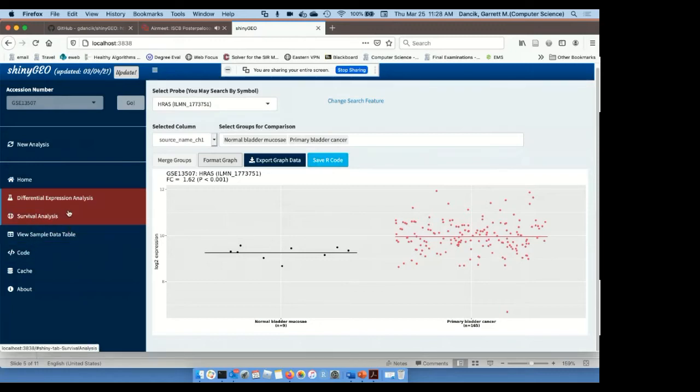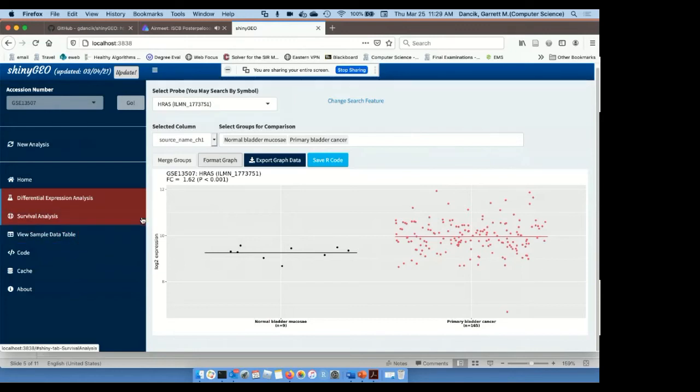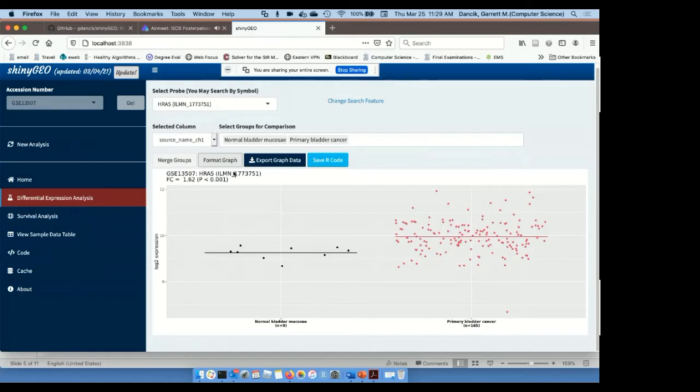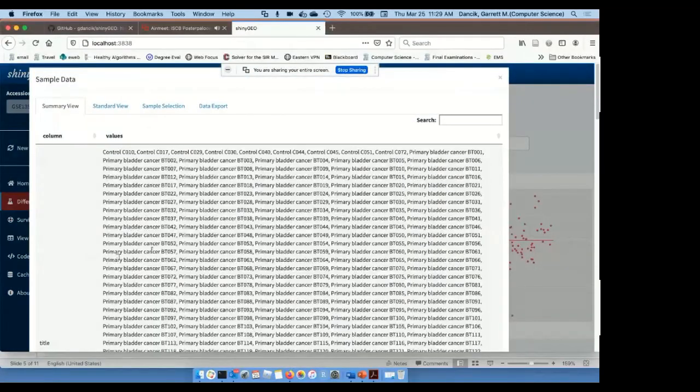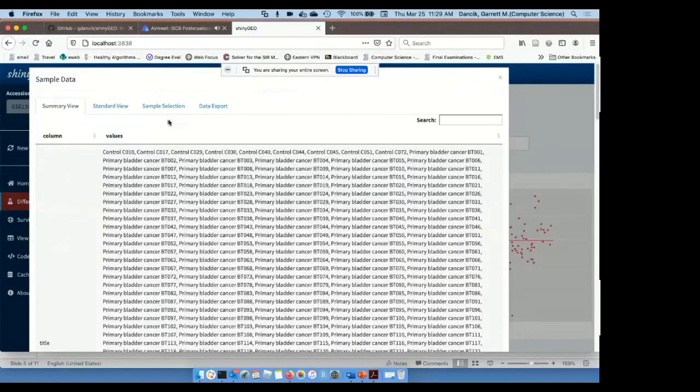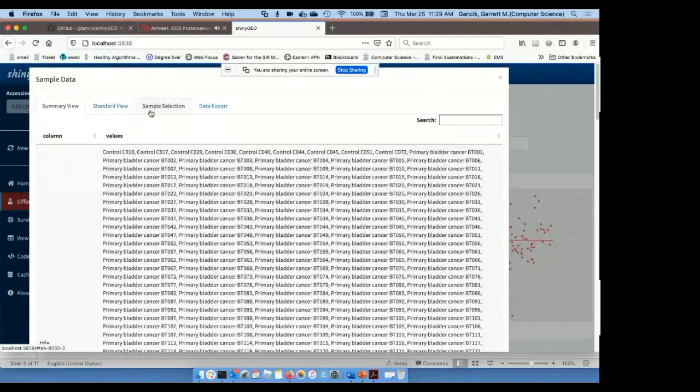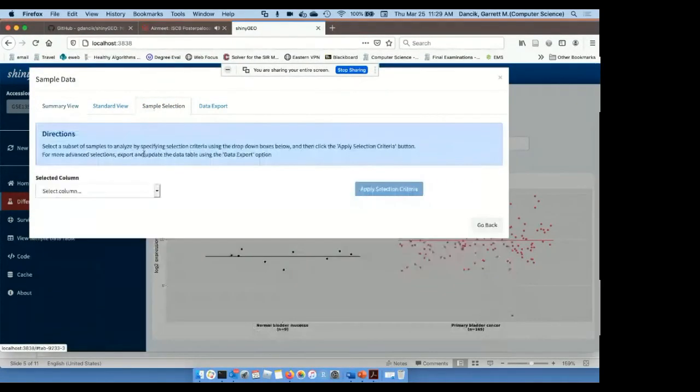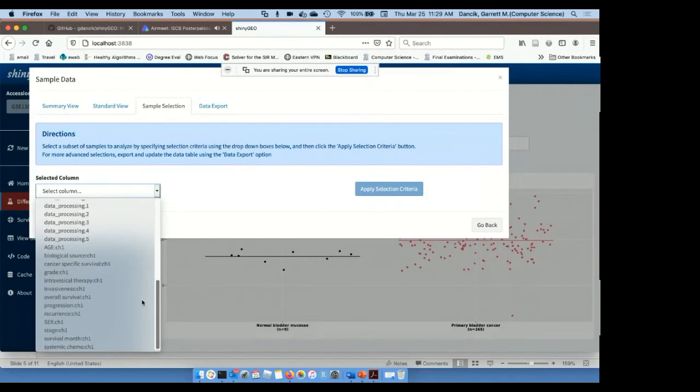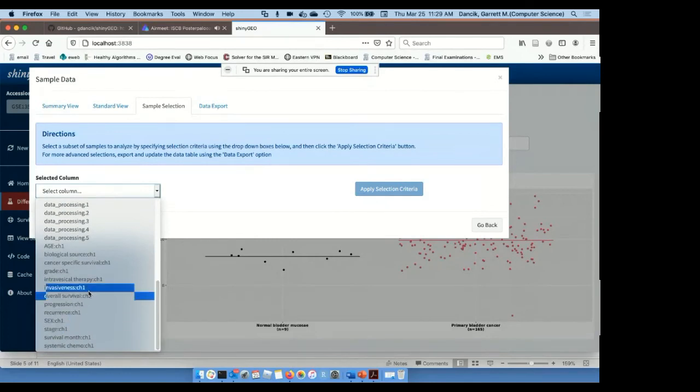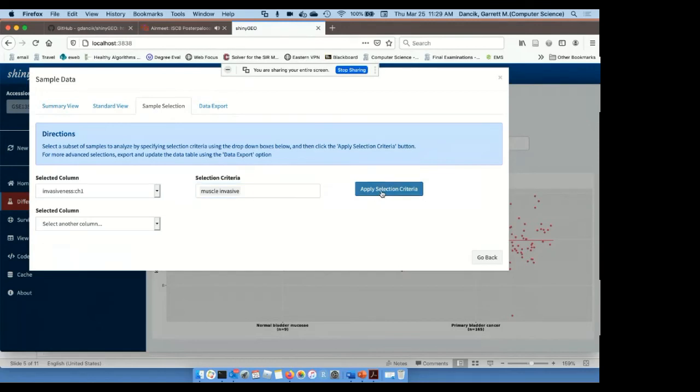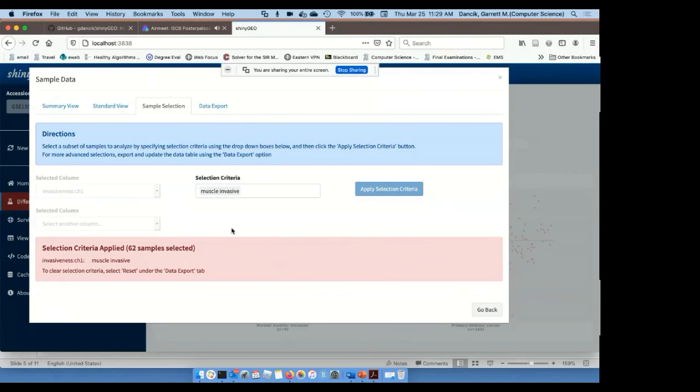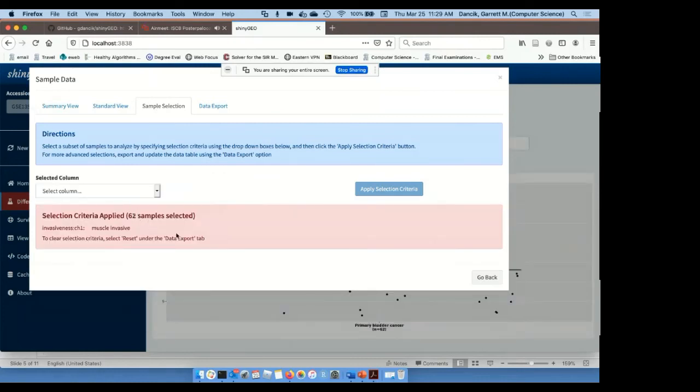I'm next going to do a survival analysis. But before I do that, what I'm going to want to do is look at just the patients with muscle invasive tumors. So my research question is whether HRAS is predictive of survival in bladder cancer patients with muscle invasive tumors. And so I want to do a patient selection or sample selection, which is straightforward to do. So I click sample selection, I select the column containing the information that I want to select on, and that's this invasiveness column. And I'm going to select muscle invasive. When I apply the selection criteria, that's going to keep just those patients that have muscle invasive tumors. And so now down to 62 samples.